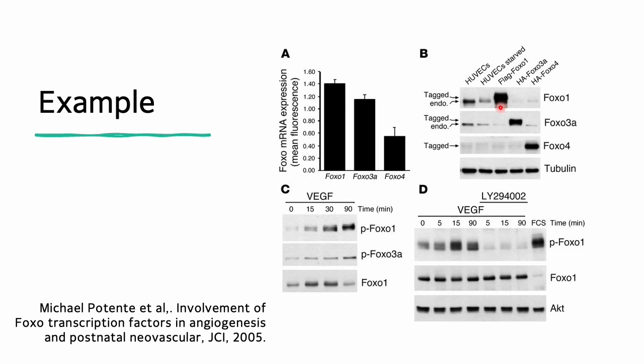They're a little bit heavier than the endogenous protein, so they're going to be located on the upper side of the endogenous protein. Actually, flag is not that big, but Western blot is that sensitive.